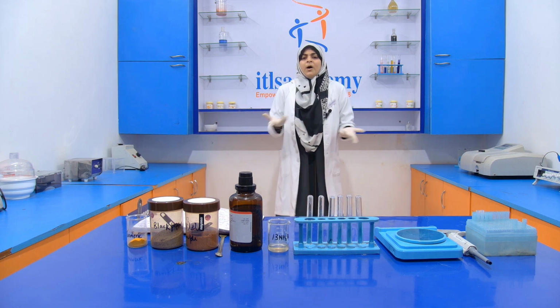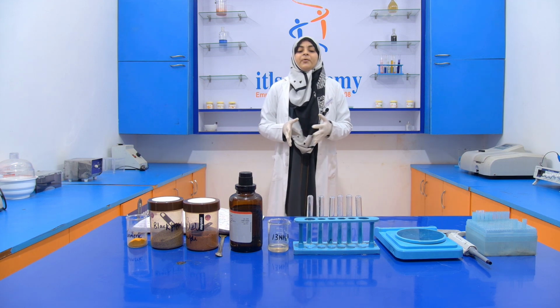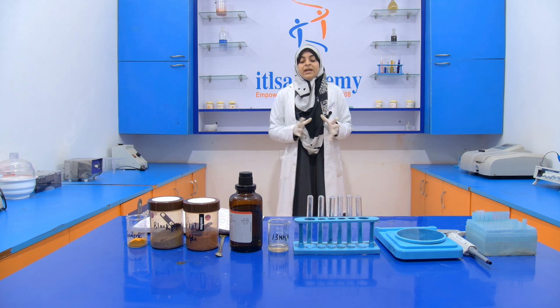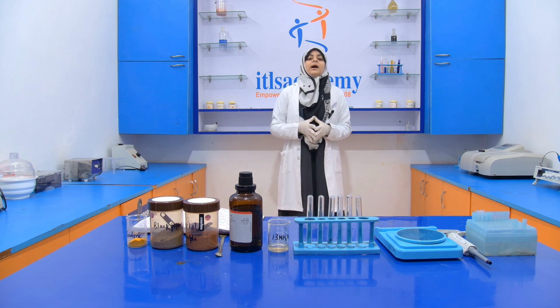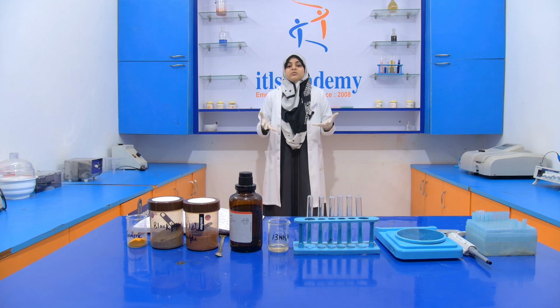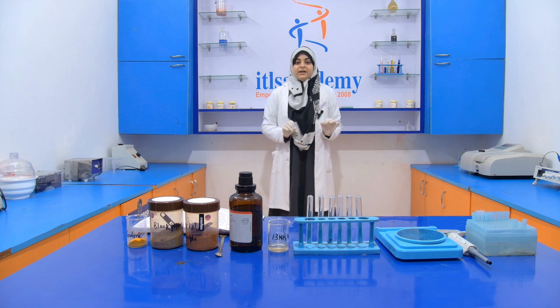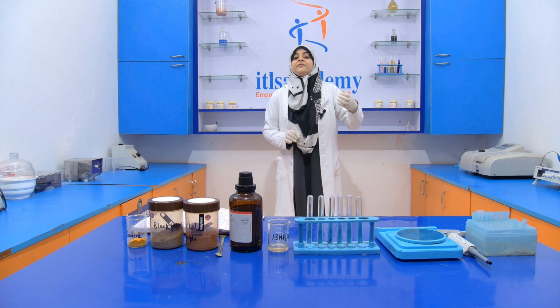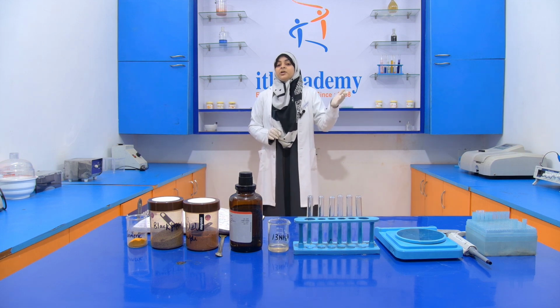Okay, now what is the purpose of adding color into a food product? Only to enhance the color of the food product. We already discussed that in case of turmeric, metanil yellow is added. Why? Only to enhance the color of the turmeric. But metanil yellow is a chemical and it has adverse health effects, we can't use it in food. Even metanil yellow is added into pulses.